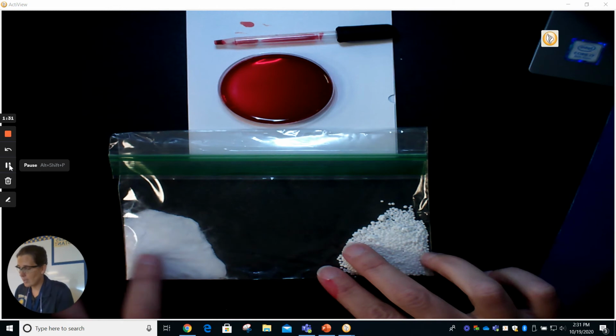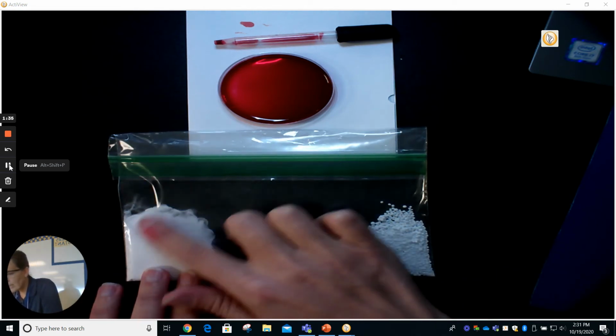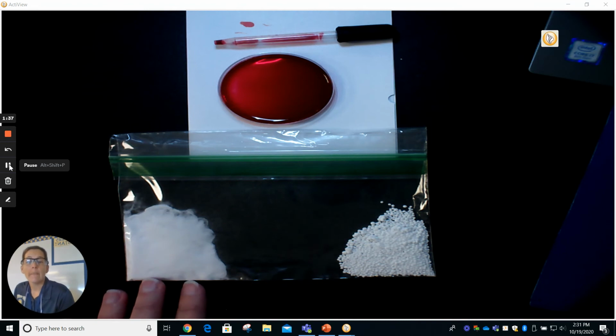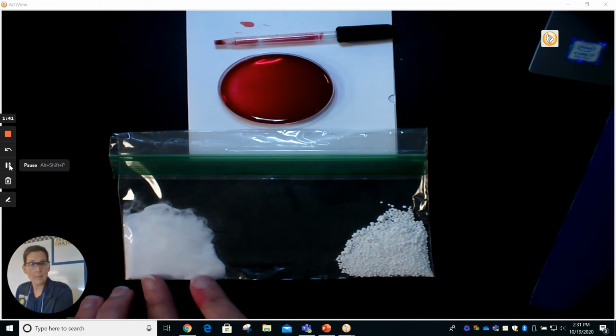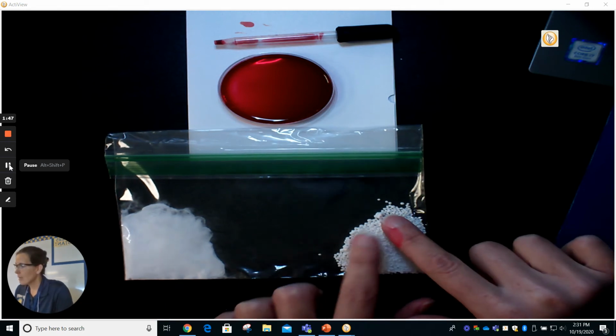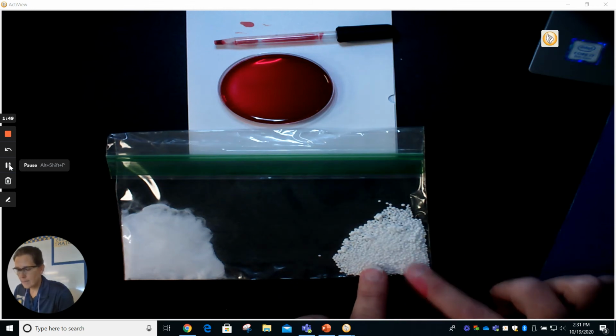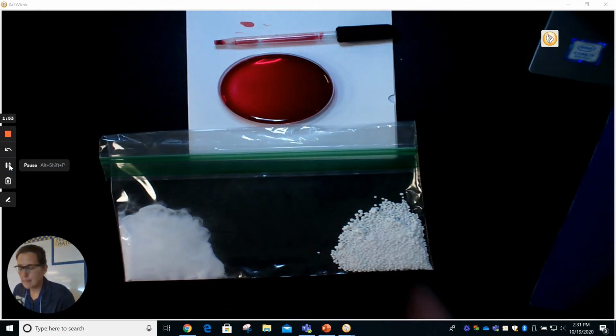And this sodium bicarbonate right here, this white, really fine powder, this is really just baking soda. So it's a fun name to say, sodium bicarbonate, but really all it is is baking soda. This one right here, this calcium chloride, they look like little white foam balls.